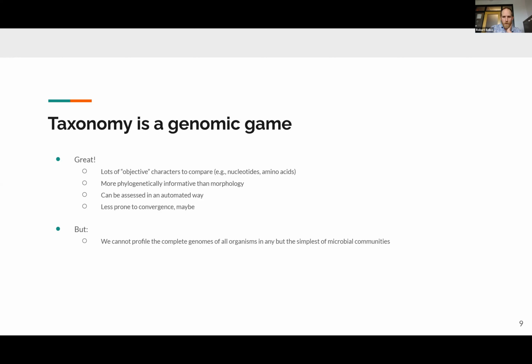However, genomic taxonomy is great with some limitations. In practical terms, if you're trying to characterize a microbial community, it's really hard to get the genome sequence of everything in order to perform this classification and attribution in anything but the simplest of microbial communities. So, oh my God, I forget her name, Jill Banfield did some fantastic work with acid mine drainage communities in the 2000s that have like 6 things in them. So that's a bit easier. It's still not trivial. But for anything like a human microbiome sample or ocean water, forget it.